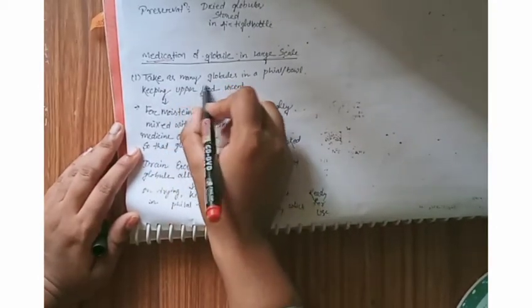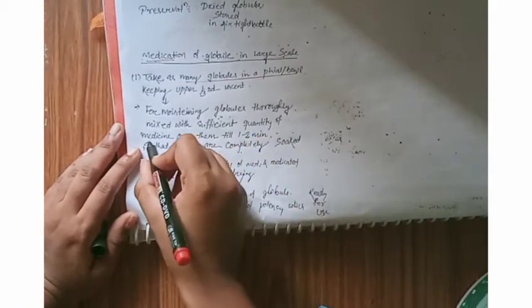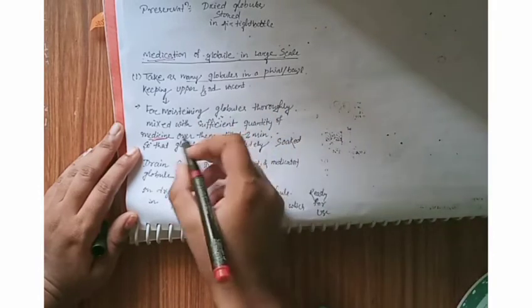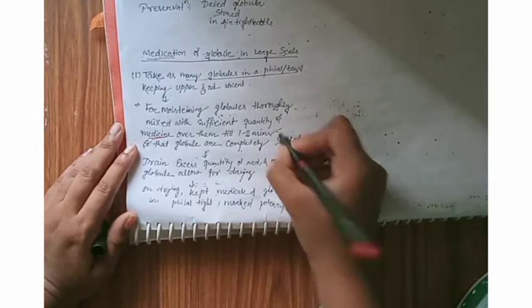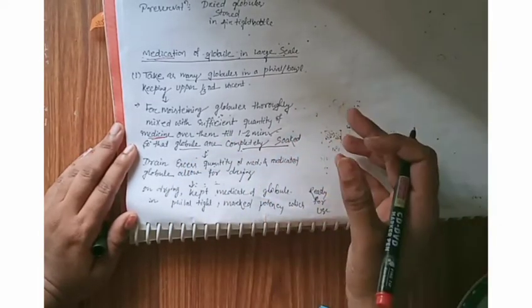First we take as many globules in a bowl, then moisten them with a sufficient amount of medicine, whatever amount of medicine we require to dispense. Then wait for 1 to 2 minutes so that the globules become soaked with the medicine.